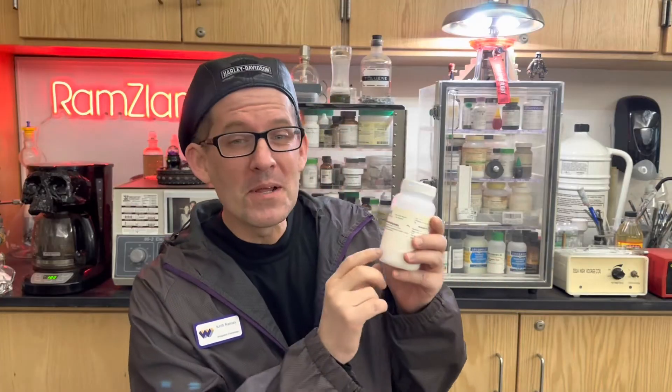Hey, welcome back to Ramseyland. Today I want to show you the amazing endothermic reaction between barium hydroxide and ammonium chloride. Check this out.